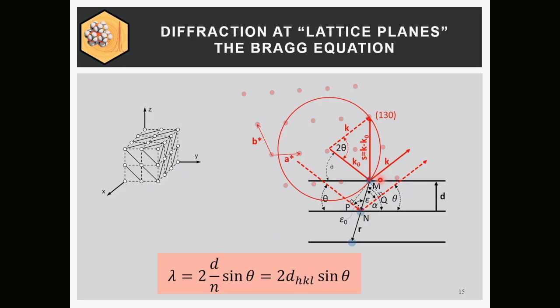It's just a little bit more complex here, because in the normal books, usually there's one atom in the first layer here, and the second atom is exactly below, which is of course not the real case. It could be shifted. But then, because of the periodicity of the lattice, the next one has to be shifted the same amount, and the same amount, and so on. But they are not directly underneath. If you do the calculation, you have a couple more angles. But finally, this is the good news, it comes out the Bragg equation, which is given here: lambda is 2 d_HKL times sine theta.